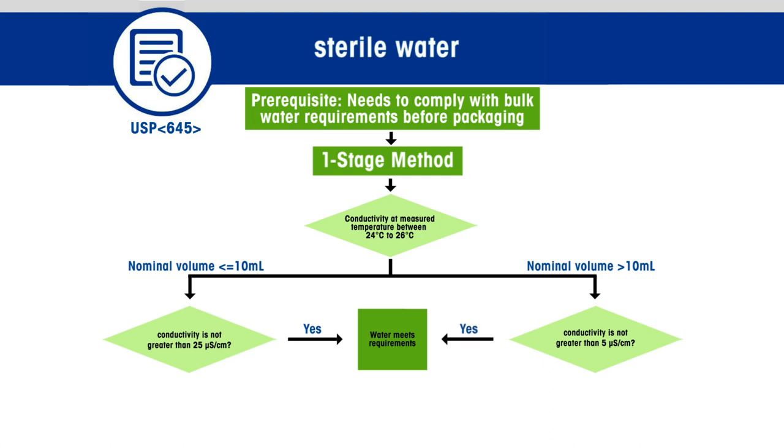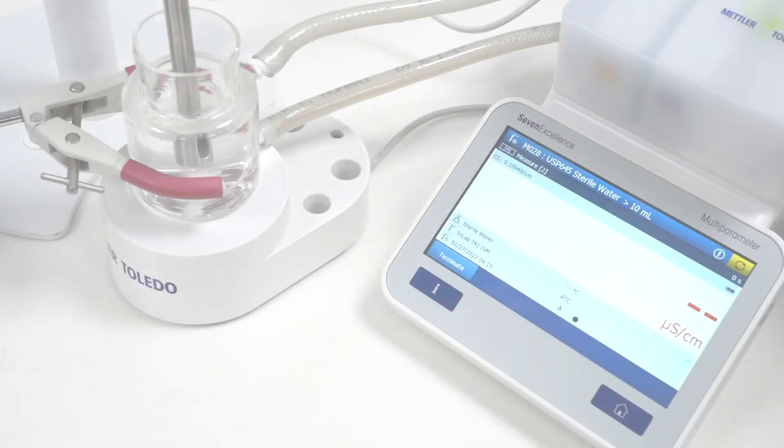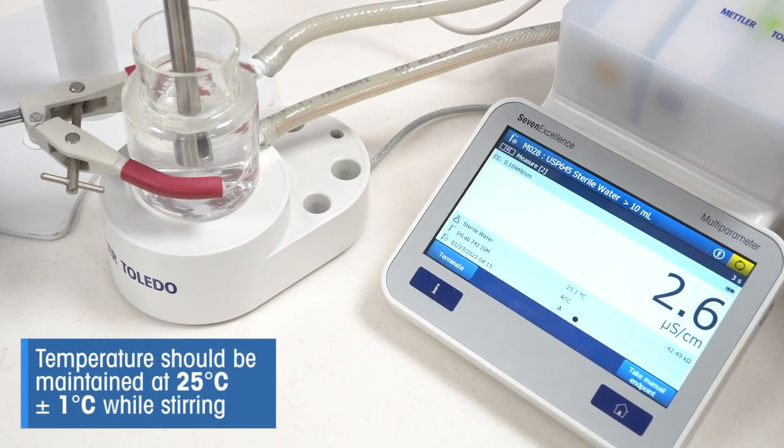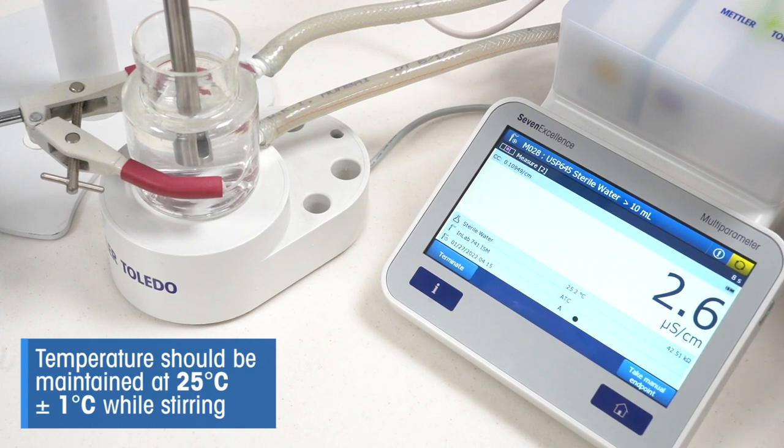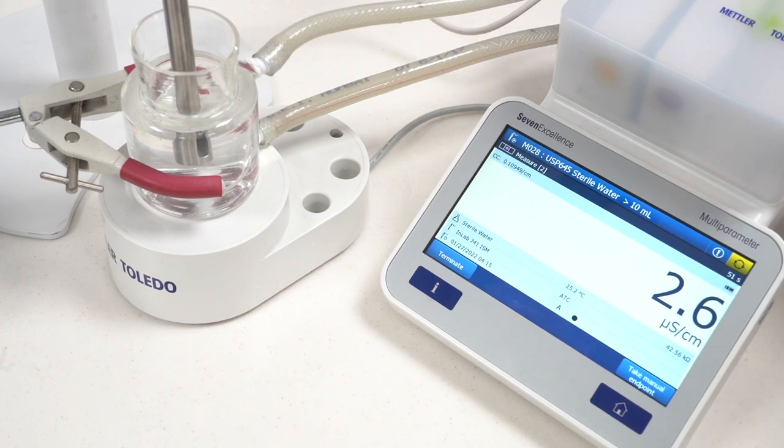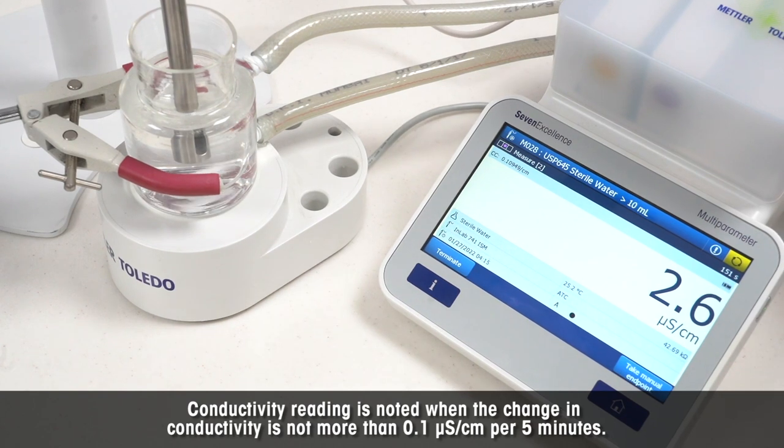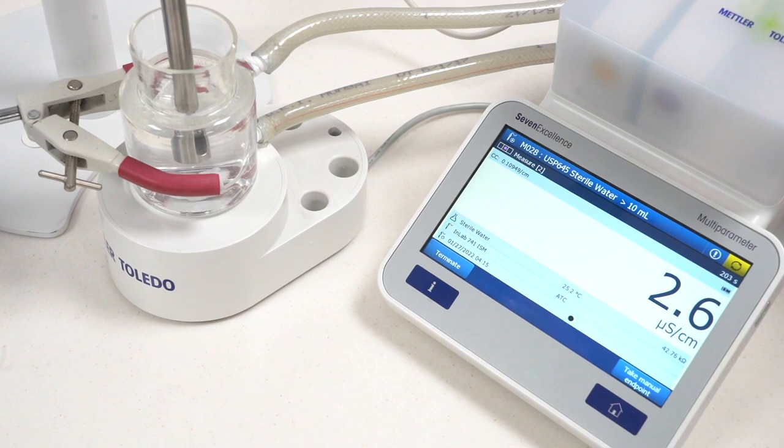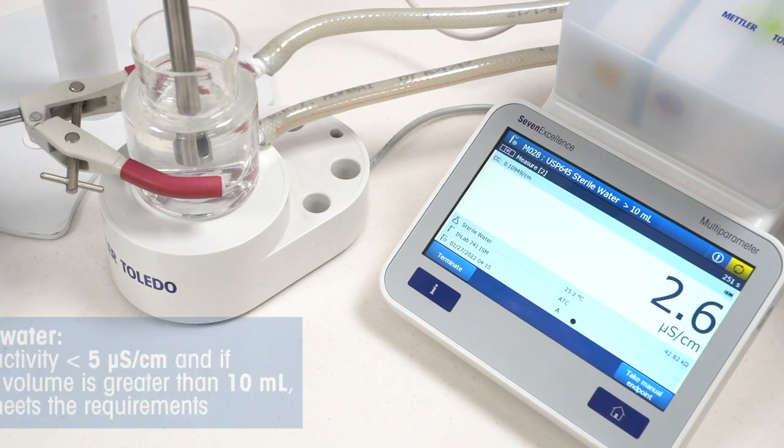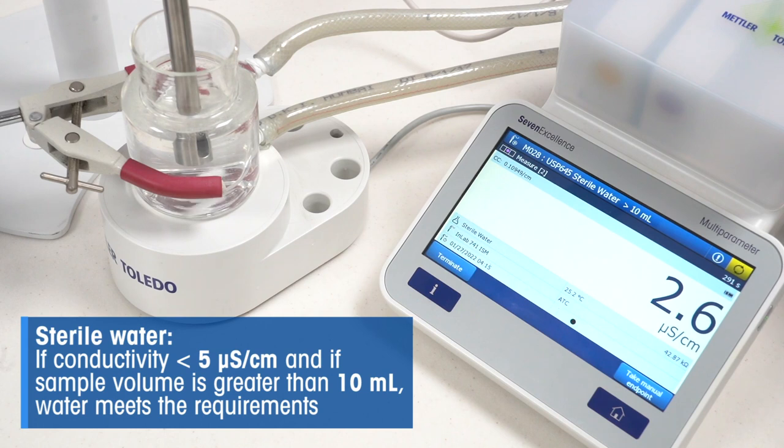Let us make an example. Here, we use the thermostat to maintain the temperature at the required 25 degrees Celsius. The water sample is stirred to generate carbon dioxide equilibrium, and the conductivity checked. When it does not change for more than 0.1 microsiemens per centimeter per 5 minutes, it is noted down. In our case, the sample volume is greater than 10 milliliters, and the conductivity is less than 5 microsiemens per centimeter. The water meets the requirements.